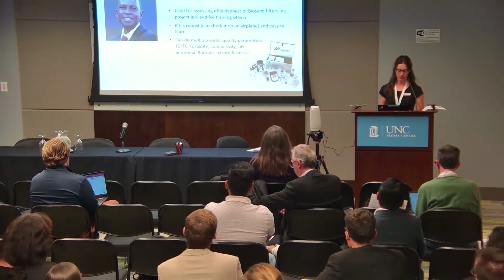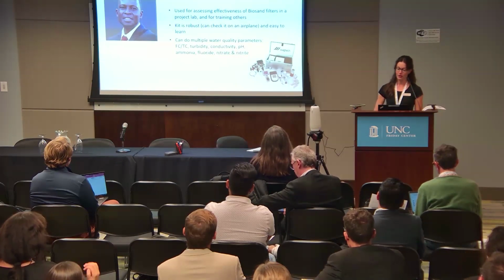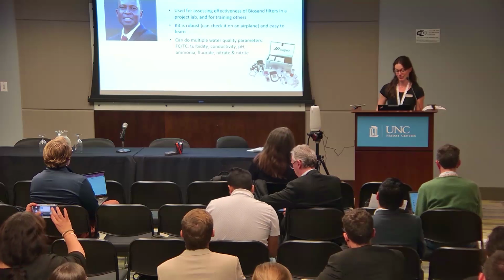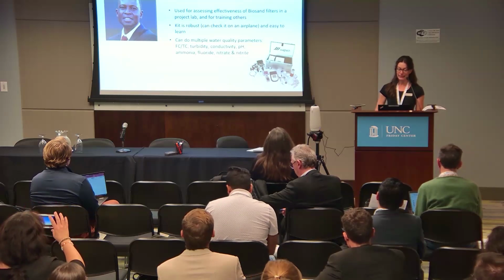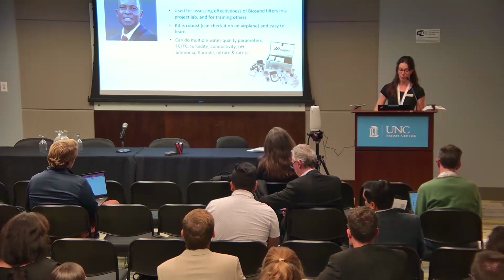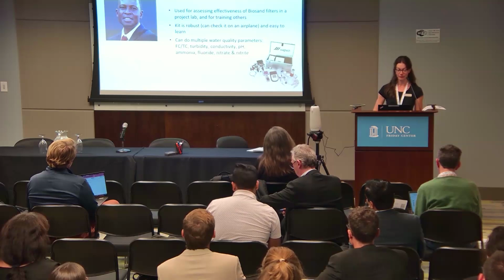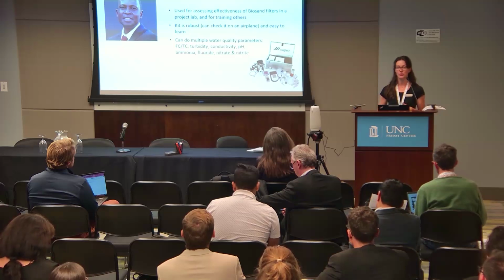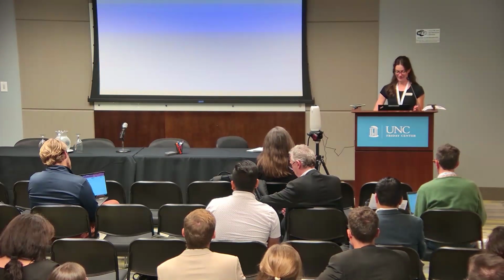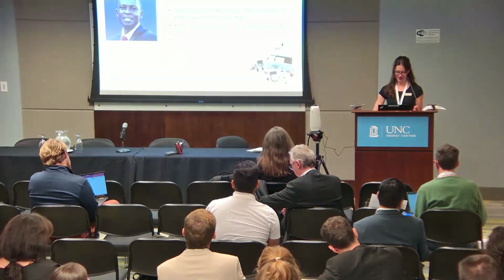So first off, I'd like to share the experiences of Elijah, who is with Seeds of Hope Partnerships in Zambia, and he is one of CAWST's training partners, and I asked him to chat with me about why Seeds of Hope selected the WagTech kit, which they purchased before 2010, so they've had it for a very long time, and just what their experiences have been with it.